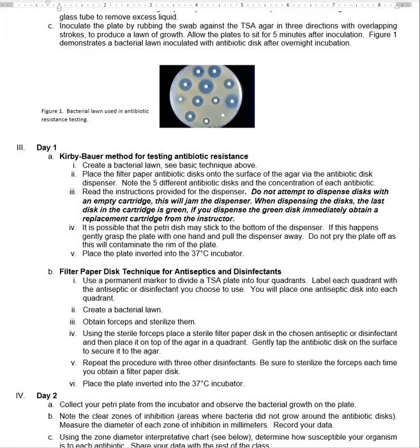We're looking to see how much bacterial sensitivity you have to these different compounds. Ammonia, you could do all these. Of course, we take our forceps and press those paper discs kind of gently. The paper discs that we're talking about using with these are basically those same little bits of paper that come out when you use a hole puncher.